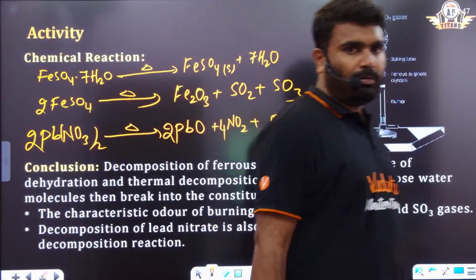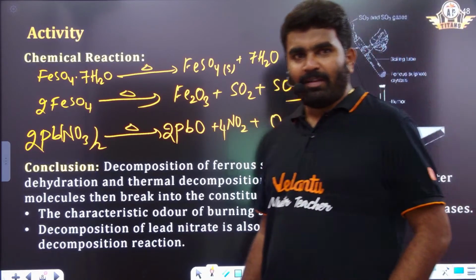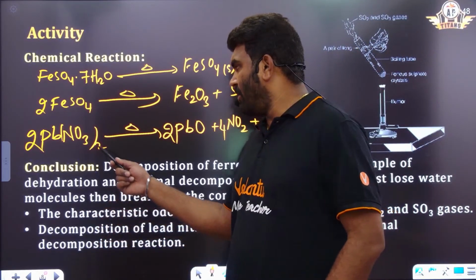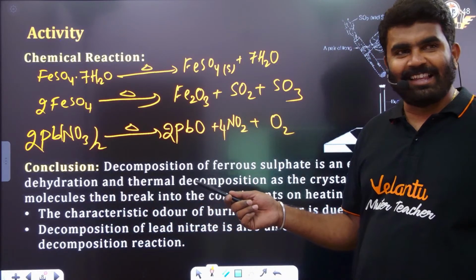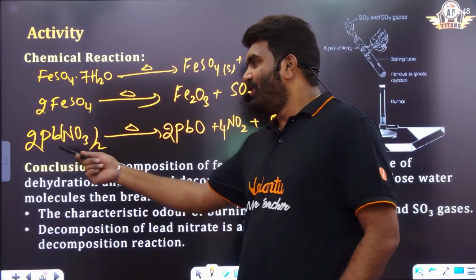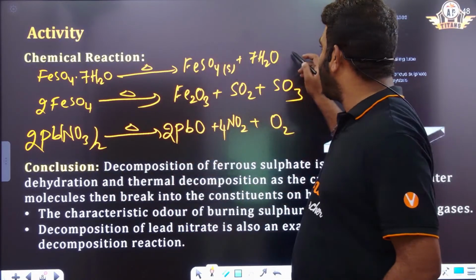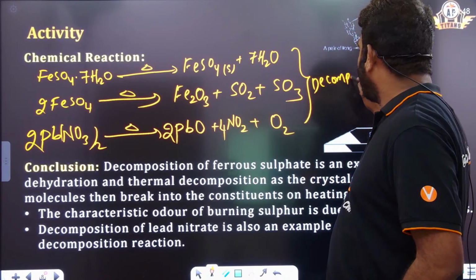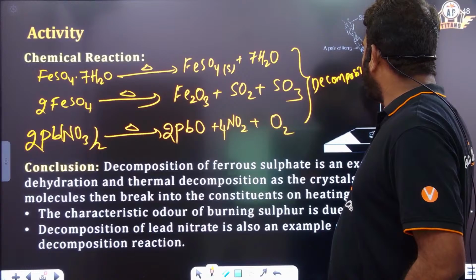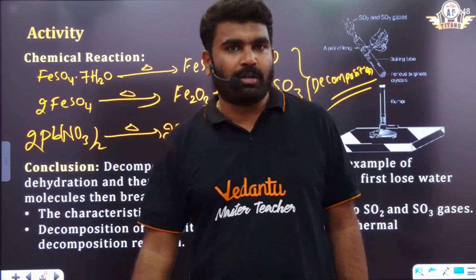ఓకే, సో ఇక్కడ చూడొచ్చు బేటా మనకి ఇక్కడ ఏమవుతుంది. హాయ్ అక్షిత. ఓకే, అందరికీ అర్థమైందా? వెరీ గుడ్, వెరీ గుడ్. సో లెడ్ నైట్రేట్ ఉంది కదా బేటా, లెడ్ నైట్రేట్. సో ఆన్ డీకంపోజిషన్, సో దిస్ ఆల్ ఆర్ వాట్ బేటా? దిస్ ఆల్ ఆర్ డీకంపోజిషన్ reaction. These all are decomposition reactions.